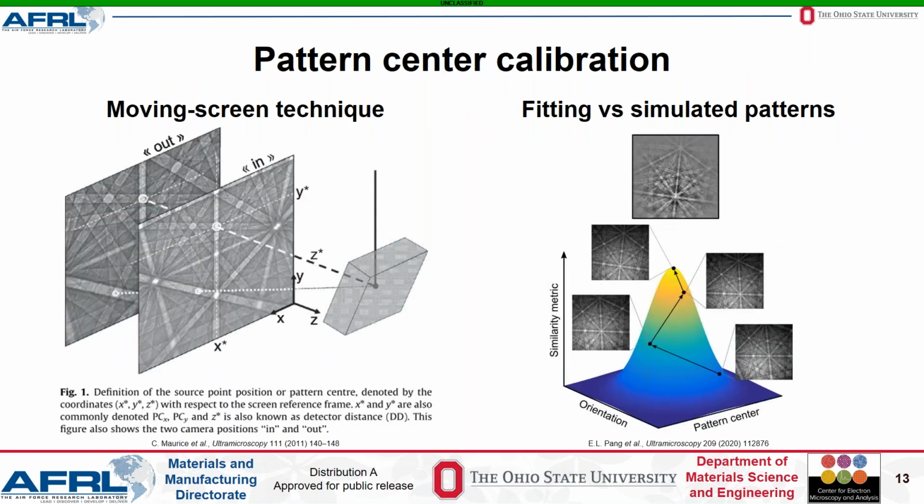The literature contains a variety of methods for determining pattern centers in EBSD. The most direct is shadow casting techniques that place physical artifacts between the sample and the detector and observe the resulting shadows on collected patterns, but these require inconvenient hardware modifications and can result in the risk of collisions inside the SEM, so they are not commonly used.